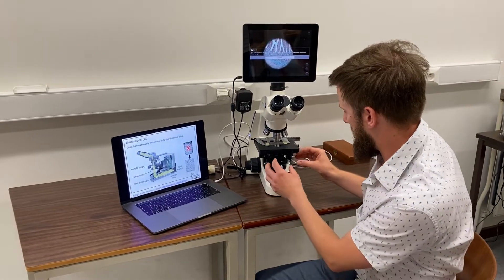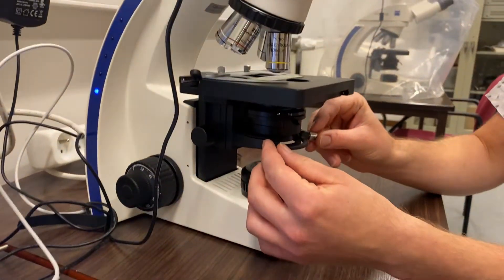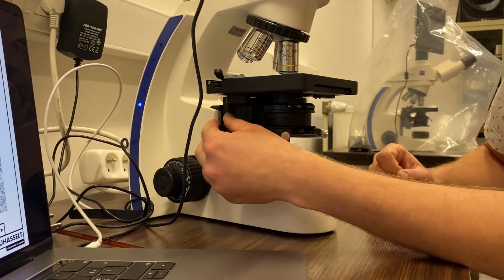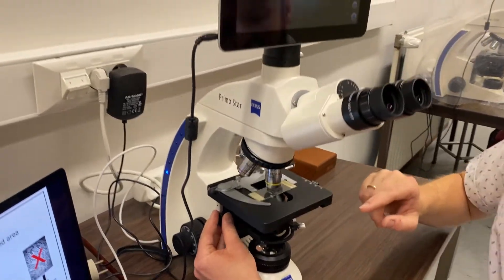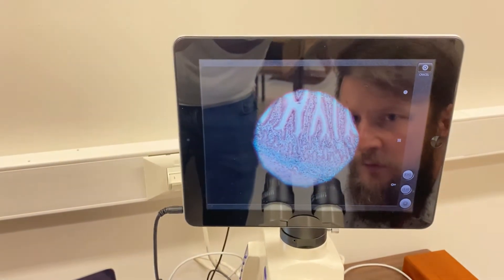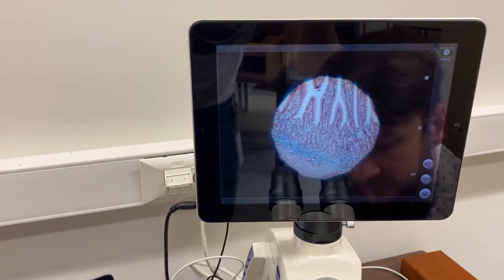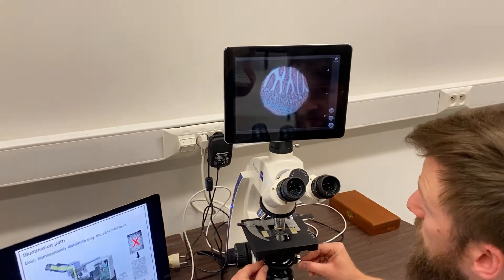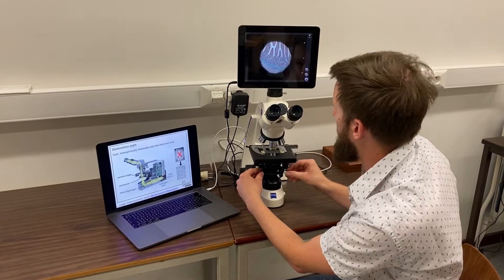Next there is the condenser, just below the sample stage. It contains a few knobs. These two knobs are used to change the position of the condenser in the lateral plane, so XY. And this knob is used to change the height of the condenser. When you change the height of the condenser, you will see the field diaphragm becoming sharp and unsharp. So it's crucial to use this knob at the condenser to focus the field diaphragm with the sample. These two other knobs can be used to move the field diaphragm image and thus move the part of the sample that's being illuminated.